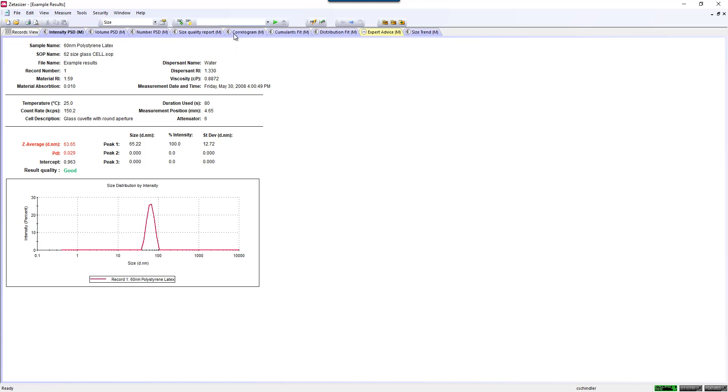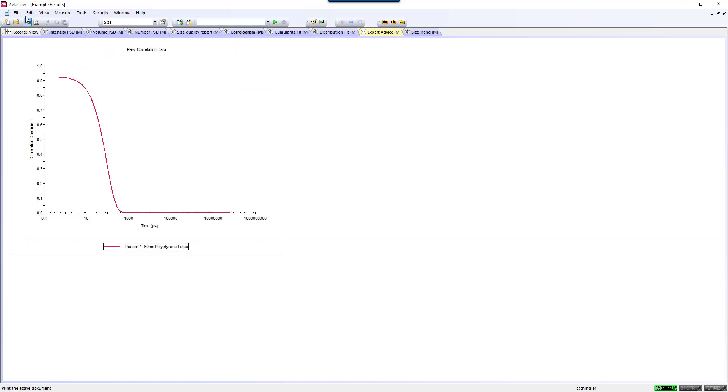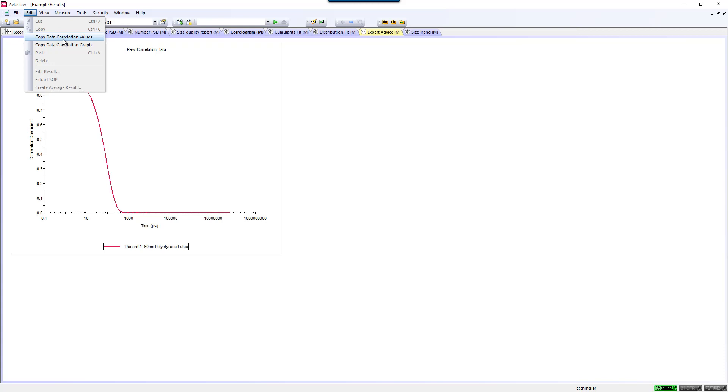Similarly, for your correlation function, you can do that as well. Copy the values, and you can paste them into Excel. Or if you're making a quick PowerPoint and you want just the graph, you can copy the graph of anything and put it into your PowerPoint.